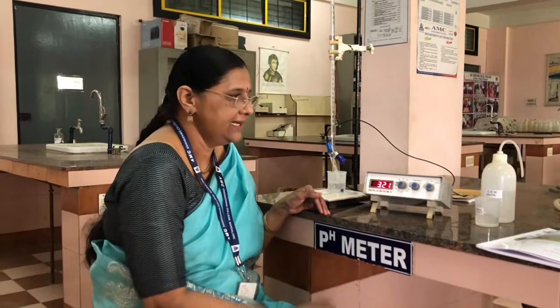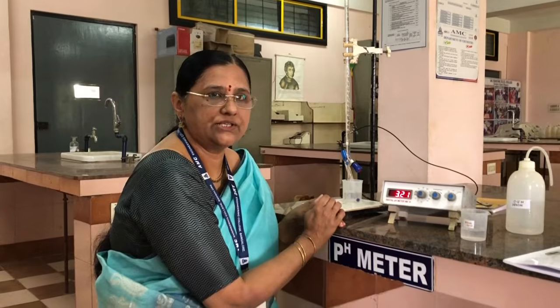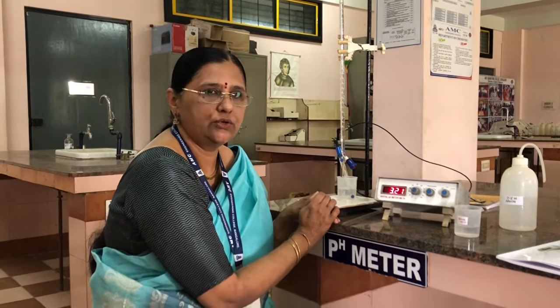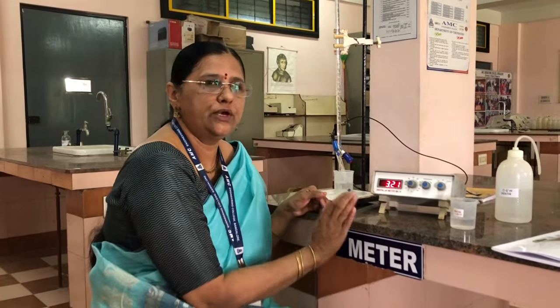Now in this experiment, we are taking a weak acid, mainly acetic acid, in a beaker, and we use a pH meter to determine pKa. What is pKa? What does Ka stand for in pKa? The Ka stands for the dissociation constant of the weak acid. So pKa is equal to minus log to the base 10 of Ka. So we are determining the pH, and from the pH we are going to determine the pKa of the weak acid.